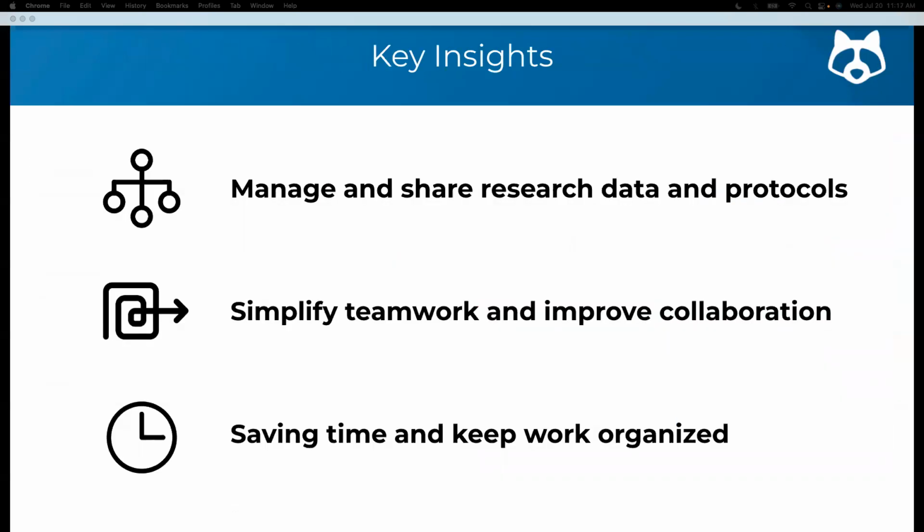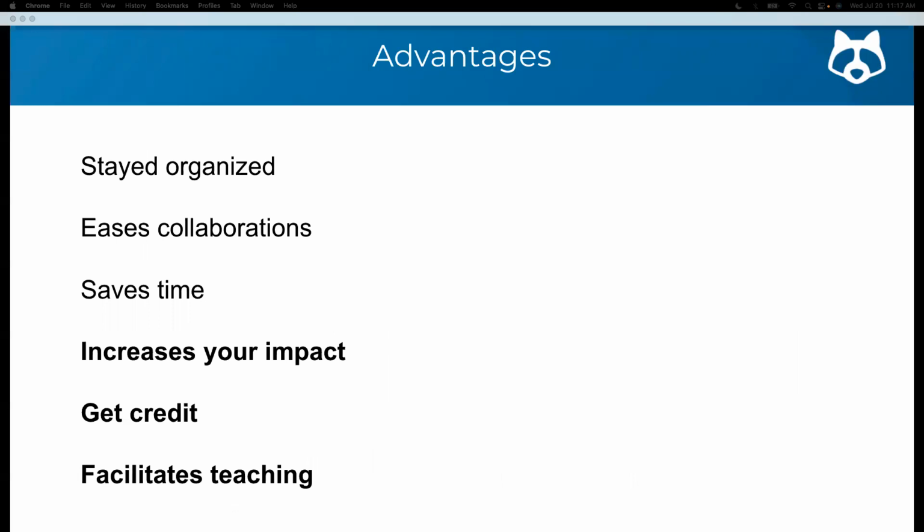As I will describe below, protocols.io can support, facilitate, and increase the quality of your research and teaching because it allows you to manage and share research data and protocols. It allows you to simplify teamwork and improve collaborations. And it allows you to save time and keep your work organized. Protocols.io is also a tool to increase your impact as a researcher, to get granular credit for your technical and methodological discoveries and innovations, and to improve your performance as an educator.